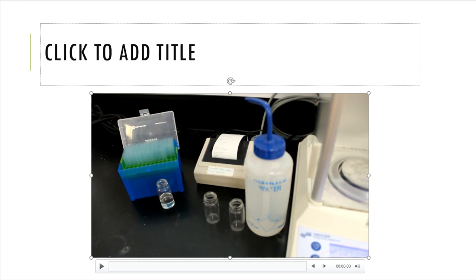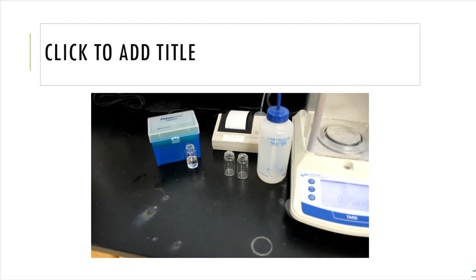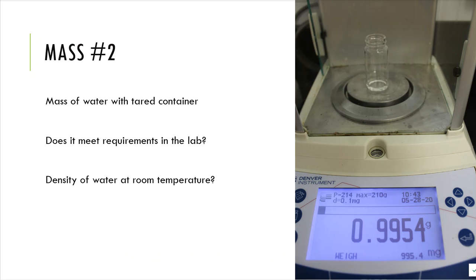All right, guys, so that's how we use a micropipette. I know that you're not here actually doing that yourself, but they're pretty easy to use once you get the hang of it. And after I delivered that 1 milliliter of water to that container, this is the number on the balance that popped out on the readout, 0.9954. So this is the amount in grams that I am saying 1 milliliter of water measures.